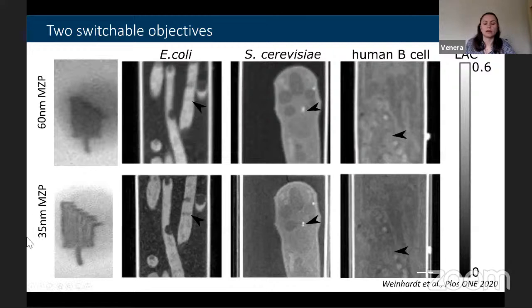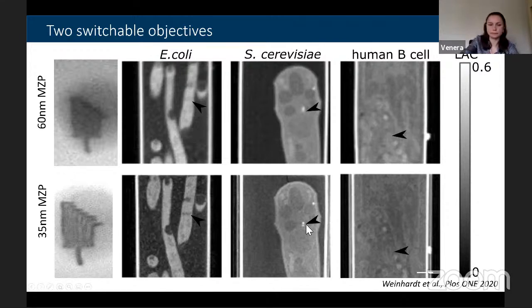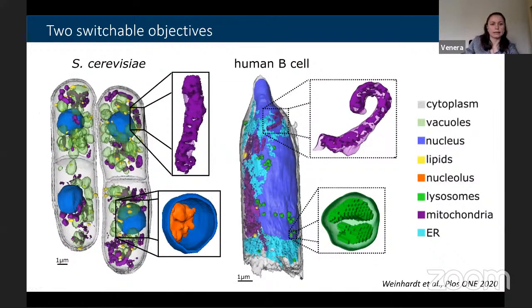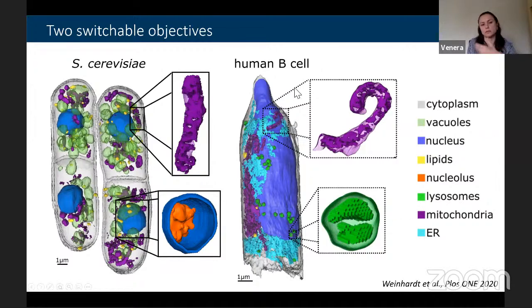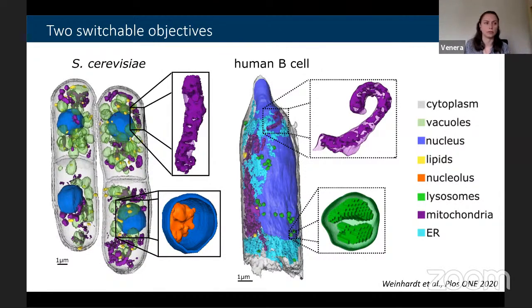Higher resolution imaging is especially helpful for bacteria and yeast, providing much finer details. With higher resolution, one can see individual cristae in mitochondria and internal structure in lysosomes, as demonstrated in human B cells — which are smaller cells well suited for 35-nanometer imaging.